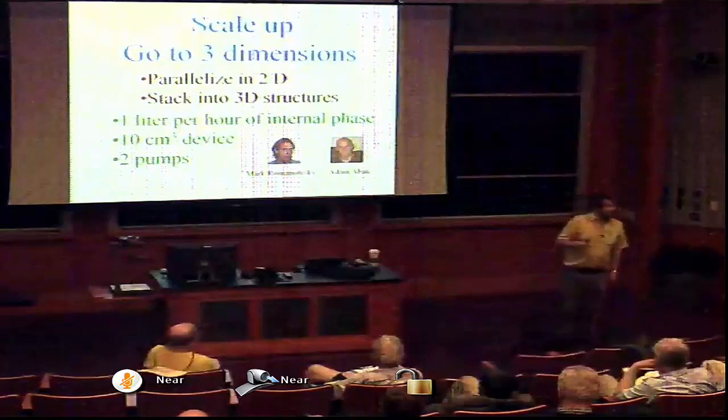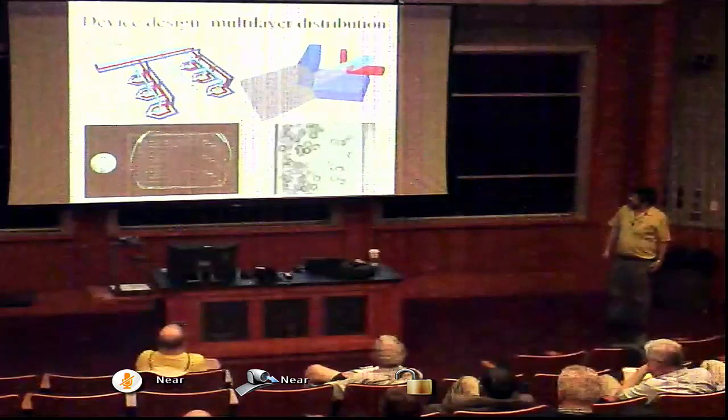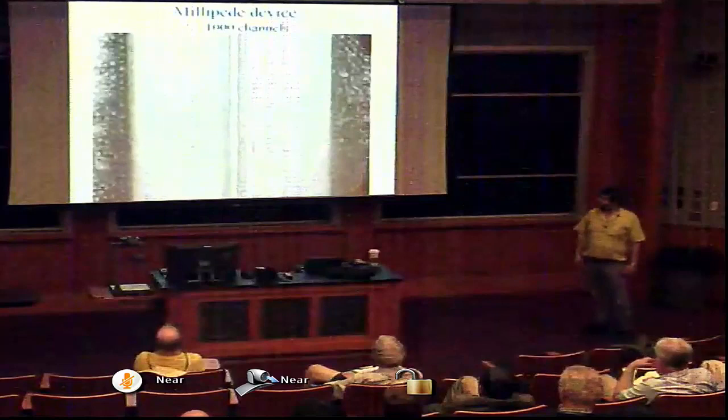So I won't go through the details, but this is a movie showing this device has 25 emulsion generators. You can see it makes a lot of material. Actually, Esther Olmsted came a little later, and she really wanted to make a lot of material. So she made what she called a millipede device. This has 1,000 emulsion generators up and down both sides. Each of these channels is an emulsion generator. That's what it looks like. So now you can see it really makes a lot of material.